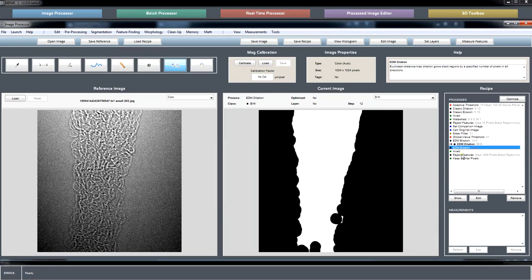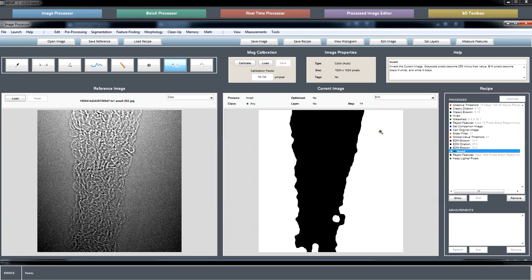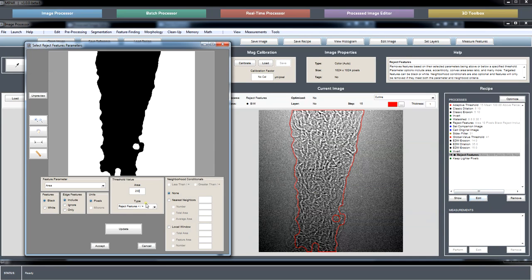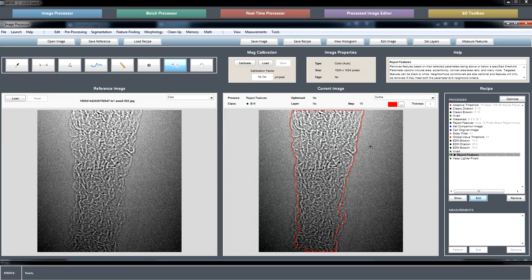A couple of erosion and dilation steps, flip it around, and now we have a rough outline of our area of interest, and we probably need to adjust these parameters here. So it's probably obvious that there's no one way to handle noisy images. It's going to depend on what kind of image you're working with and what steps you need to apply to deal with the noise.